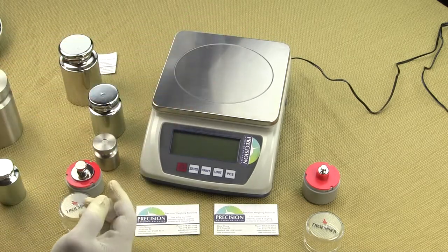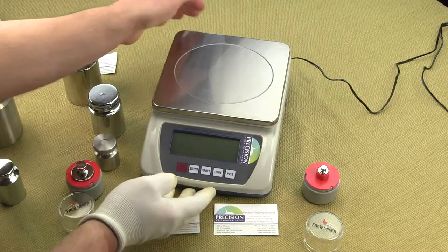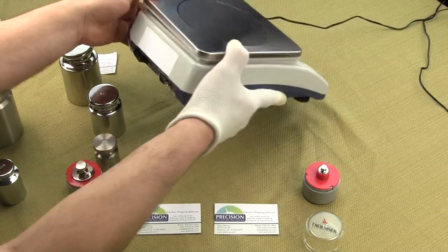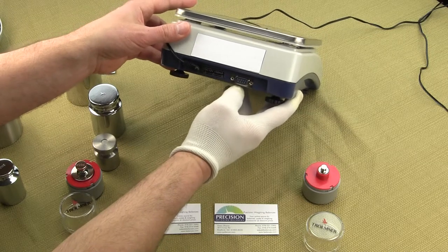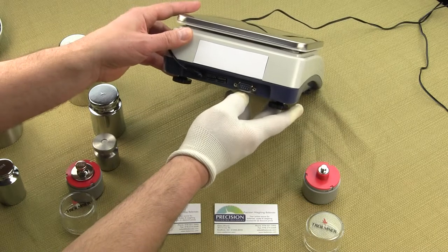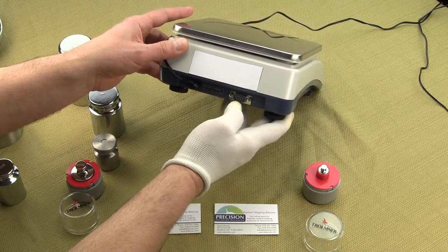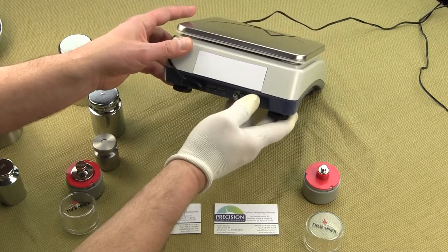The rugged ABS housing features a heavy-duty load cell. You have four adjustable feet for leveling beneath the balance. The rear of the scale has an RS-232. This RS-232 is not supported by us, but if you are familiar with RS-232 and HyperTerminal, you could use this interface to export the data, though we won't support that.